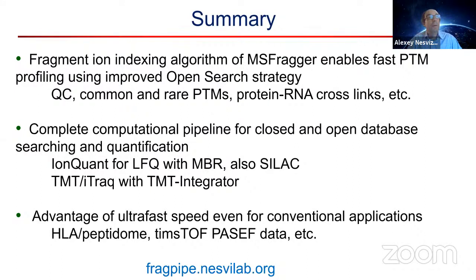Well, for any protein that's decently enriched in the data set at a high abundance, we gain in the number of PSMs that we identify, because we start picking up a lot of PSMs that are modified peptides for those proteins. So the only time we would be losing something is if it's a low abundant protein.